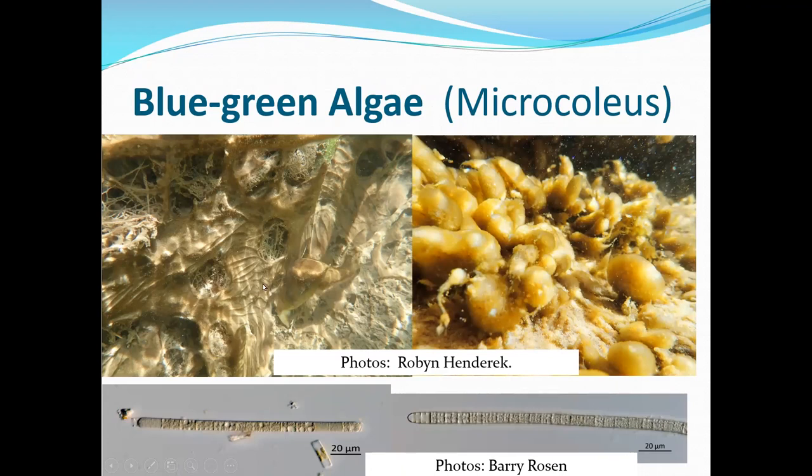We're pretty sure it's Microcoleus anatoxicus. Barry's still not sure he agrees. We also were able to culture this and send it off for analysis. But I'll tell you that 3 years ago, before I got to look at this material, I would have looked at that and thought, oh, that's just diatoms. I would have thought, oh, that's just diatoms covering detritus.